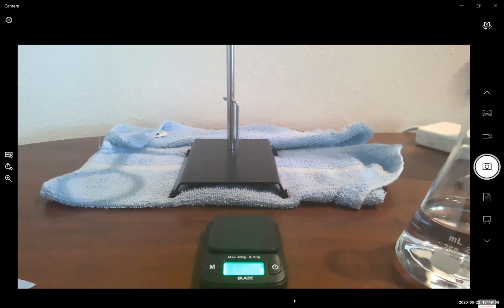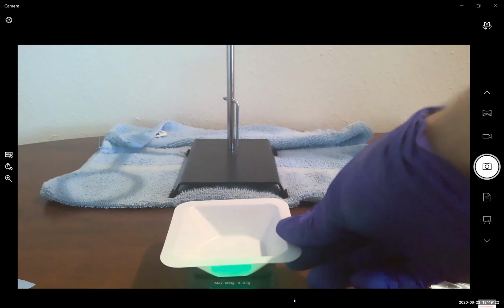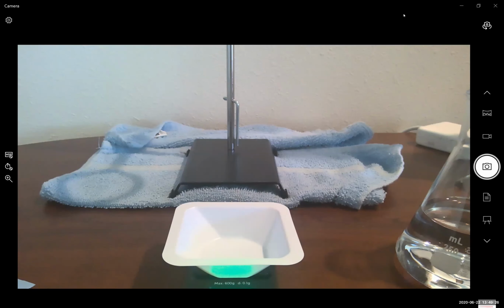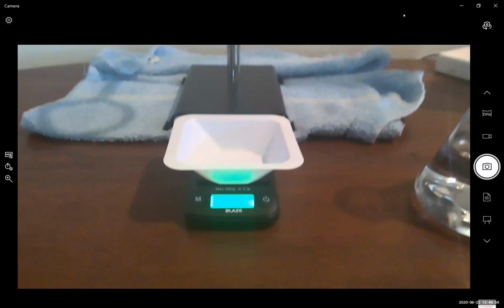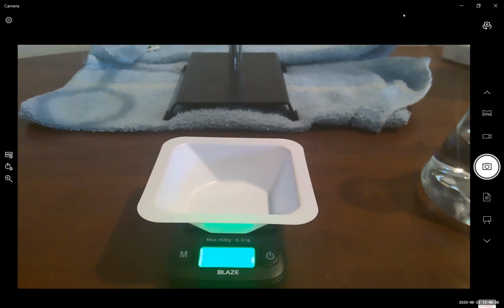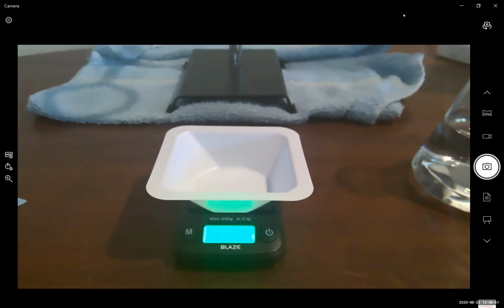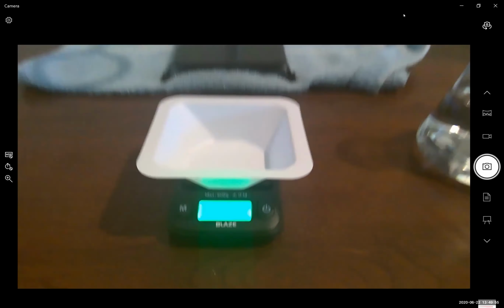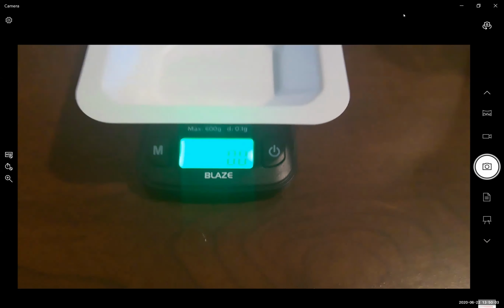Okay, so you're going to tare your scale and it should show 0.0. Then you're going to place a weigh boat on the scale and tare the scale again. Before looking at our weigh boat, we see a value of 2.7. That is the mass of our empty weigh boat. Now we're going to tare our weigh boat and record the mass again. It should read 0.0 if everything is done correctly and it's fully tared.